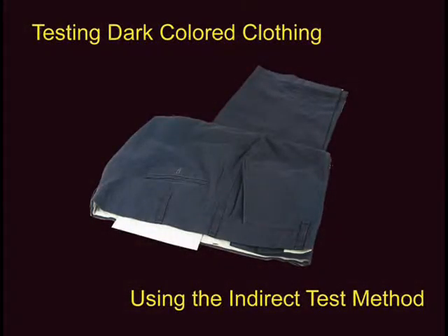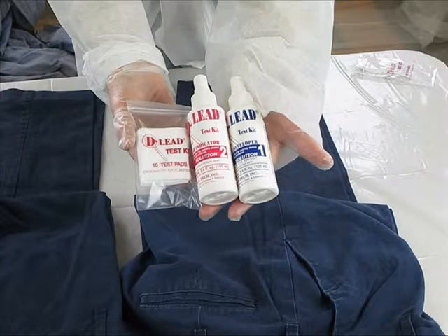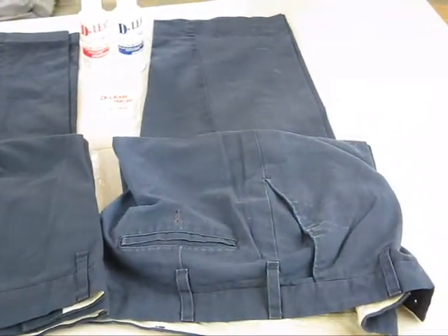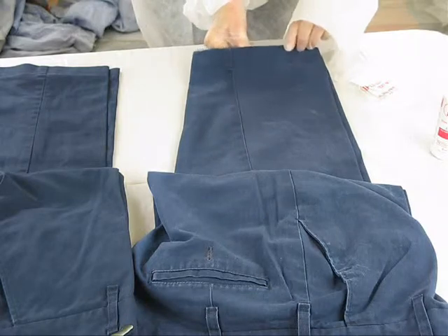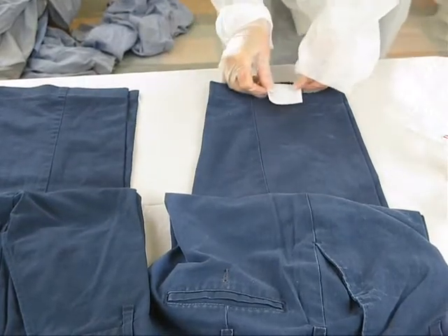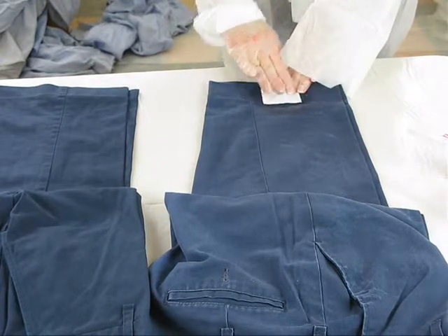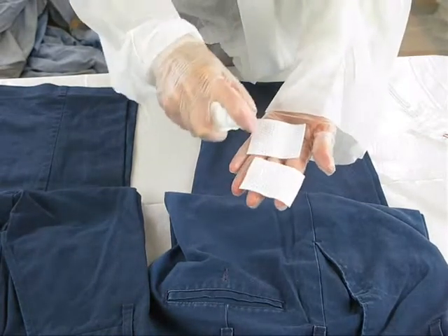When testing dark colored clothing, the indirect test method is recommended to make the yellow color from a positive test more visible. For the indirect test method, you will also use D-Lead Test Pads along with the two test solutions. We've selected the bottom of the pant leg for this test. Begin by placing a test pad under one layer of the fabric to be tested. It's important to test only one layer of fabric at a time, so the pad is placed inside the pant leg. Using Solution 1, thoroughly wet the fabric to be tested in the area over the test pad. Then place a second test pad on the fabric surface directly above the first test pad and press down firmly on the test pads to allow both test pads to absorb the liquid. Remove the pads from above and below the fabric and moisten with Test Solution 2. If a yellow color appears on the test pad, lead is present.